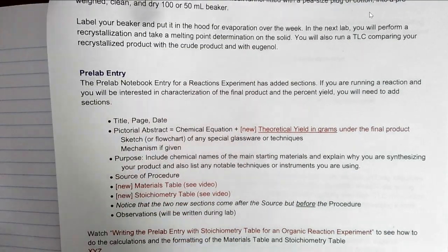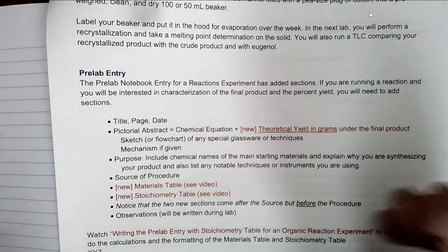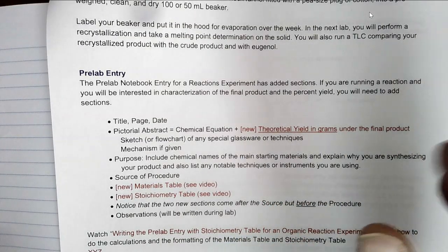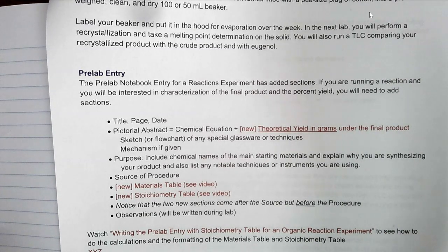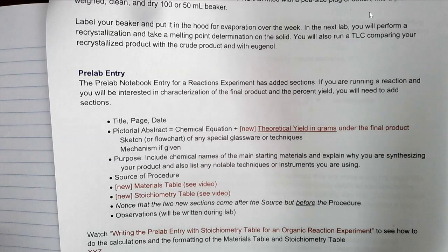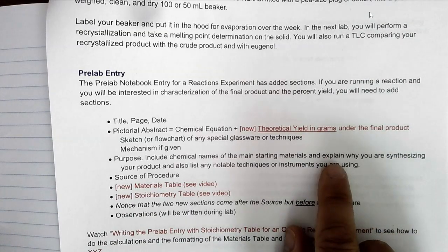Next is the purpose. You really should have the chemical names in the purpose because you're going to react starting material A with starting material B in a reaction. I don't think we tell you what kind of reaction this is, but it's called an acyl substitution. You don't have to write that because I don't think that's in the handout. To make eugenol benzoate. There is a reason though why you are making eugenol benzoate, so you can explain why.